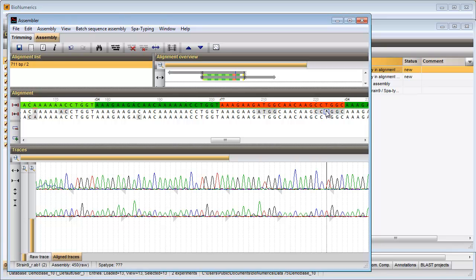Updating the base calling in one of the trace files automatically updates the consensus sequence. The consensus sequence should now have a perfect match with spot type 186.